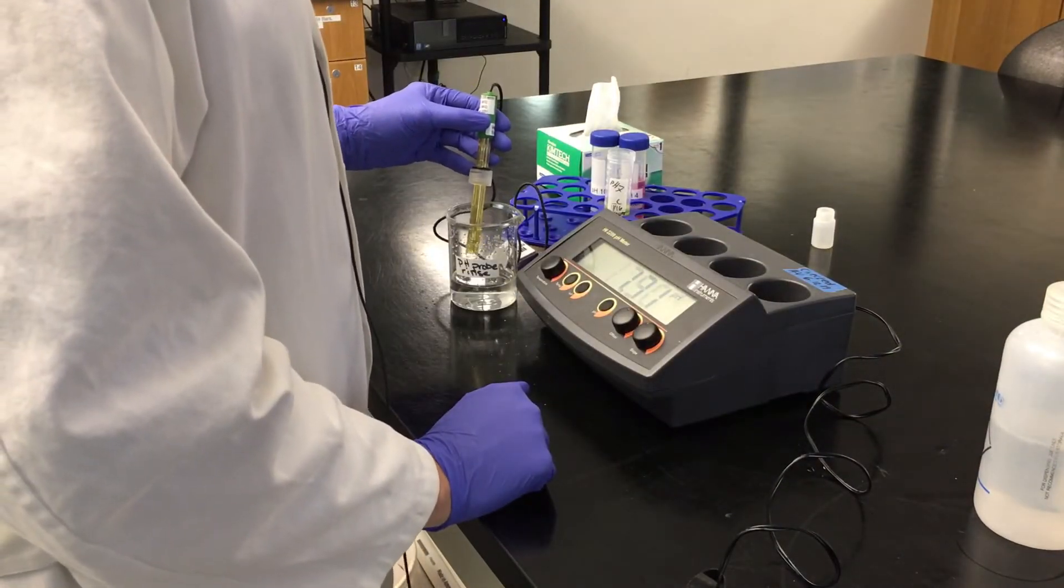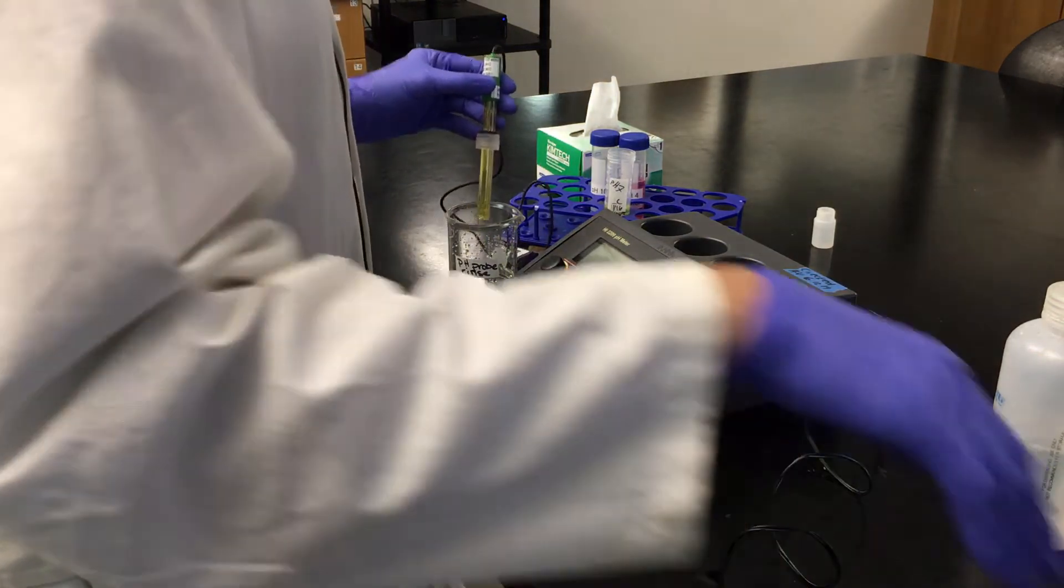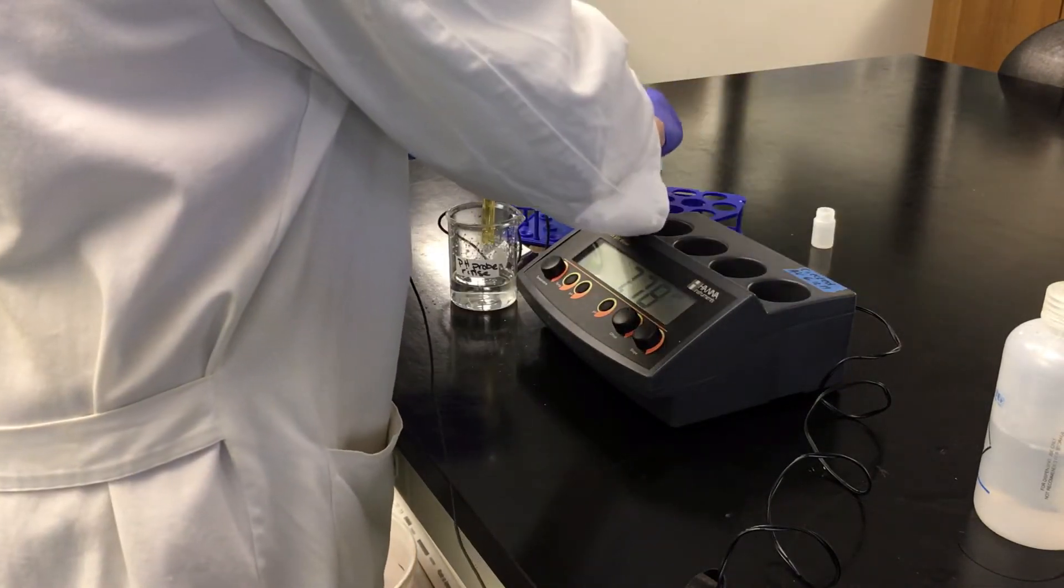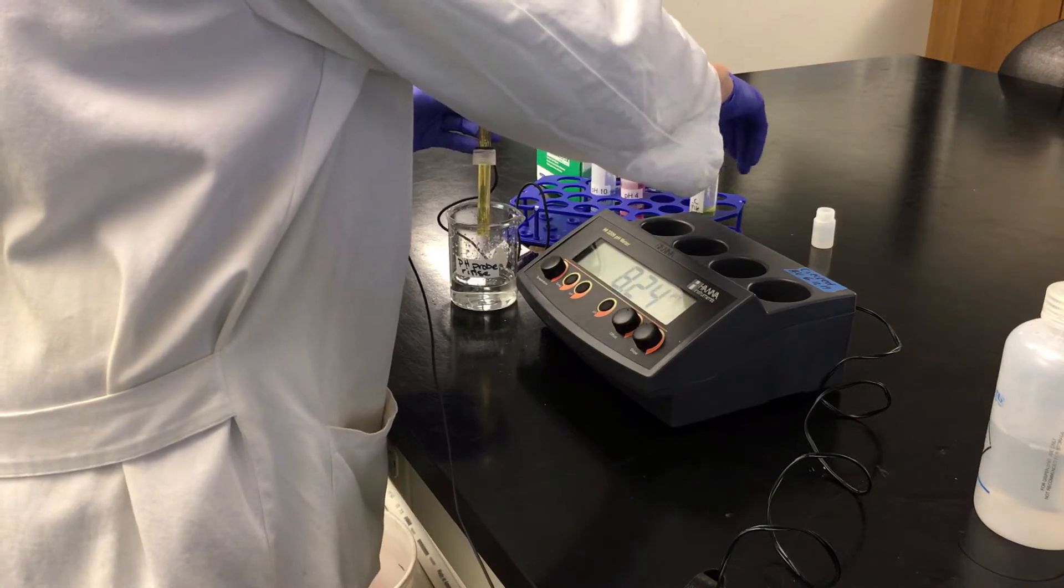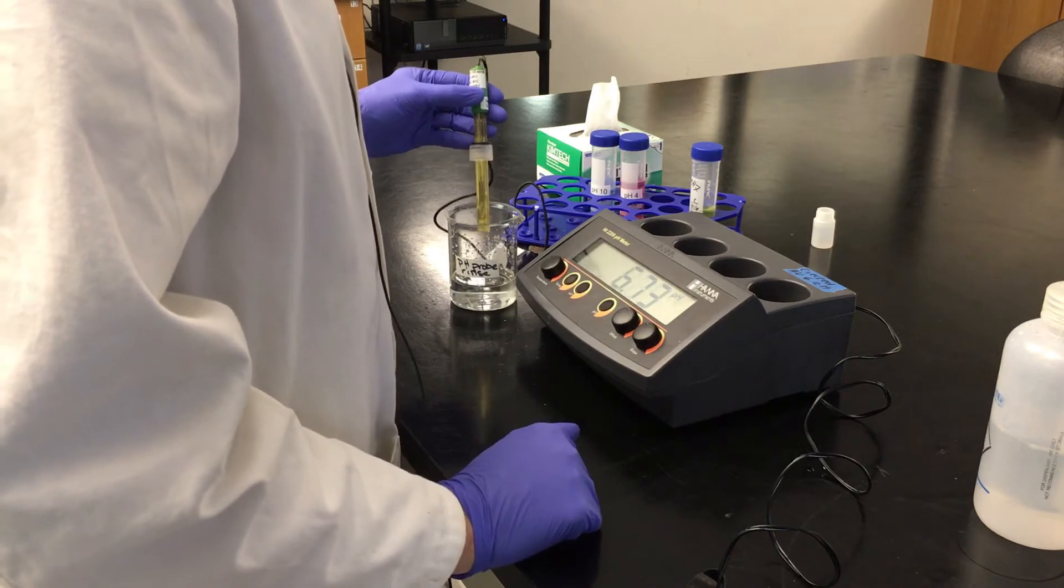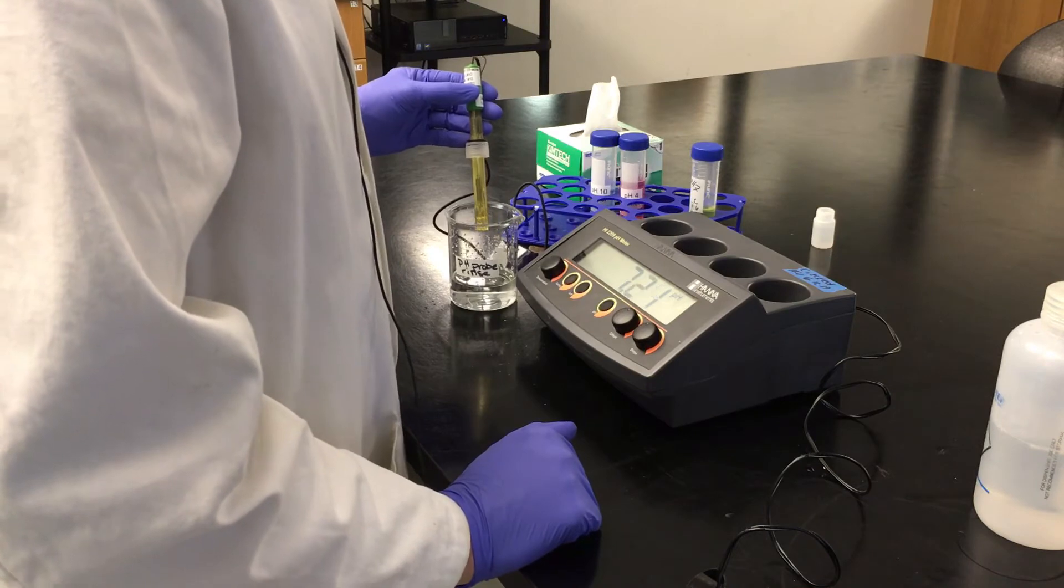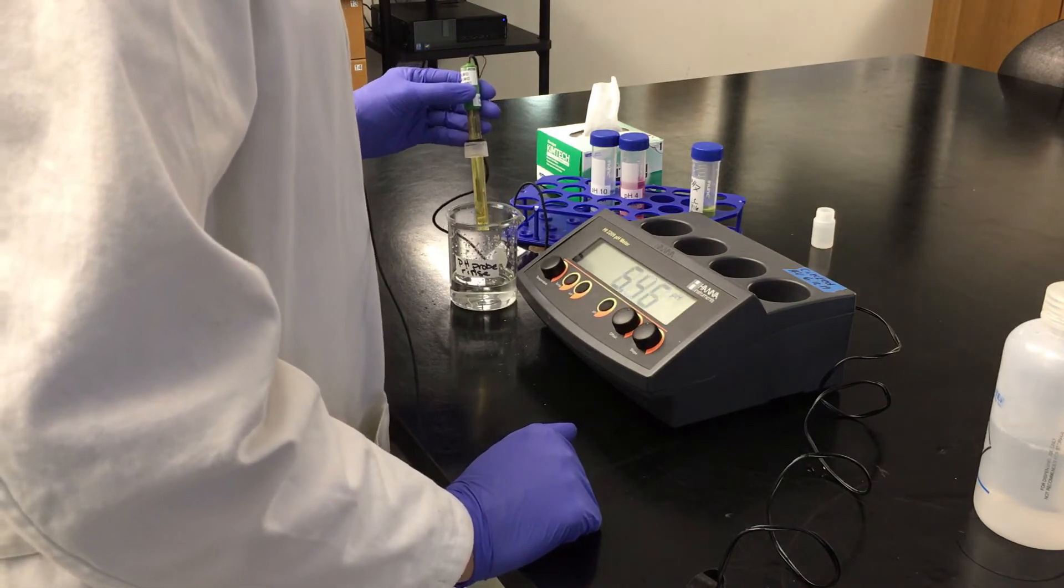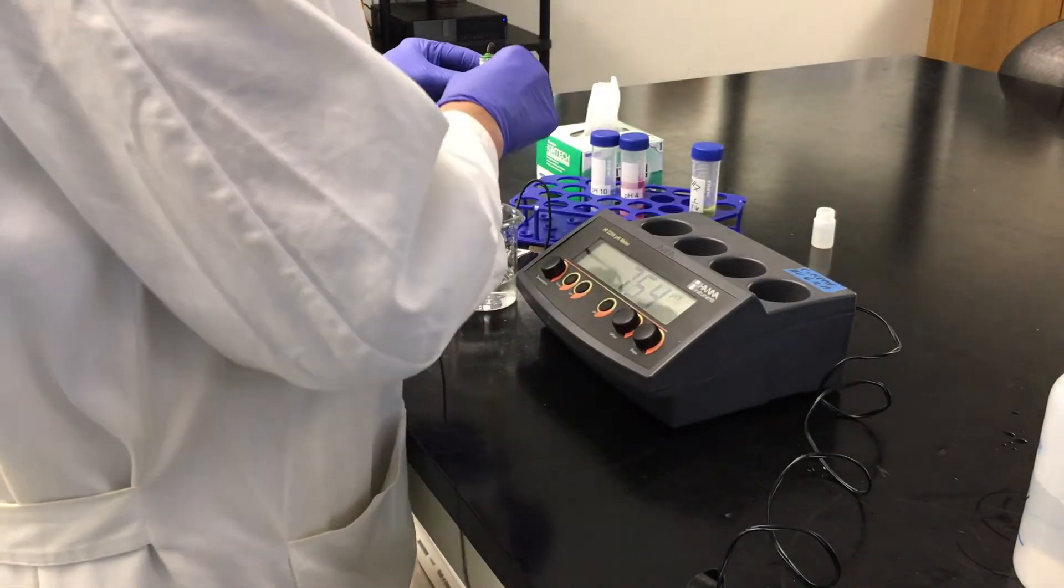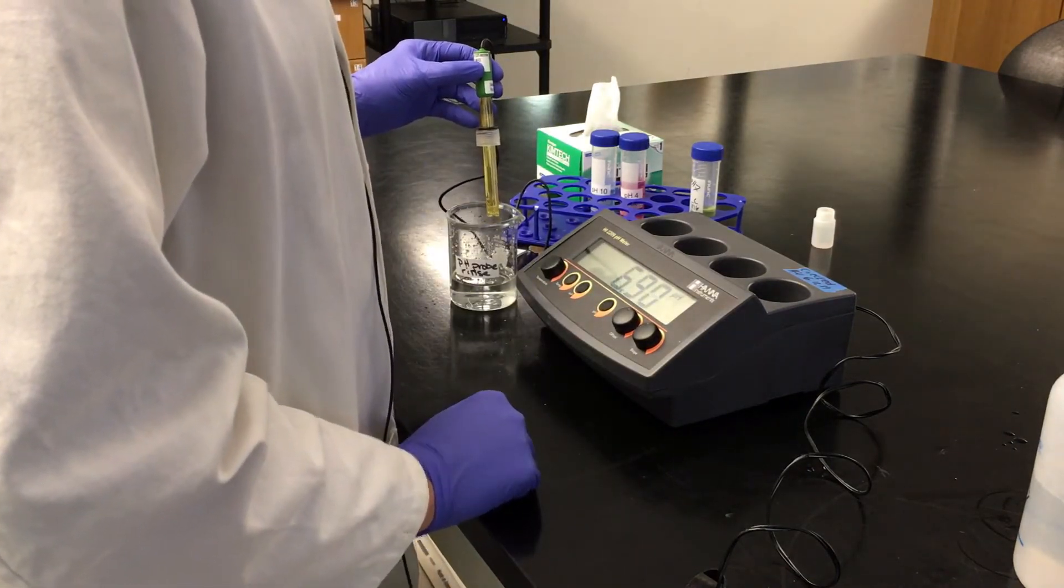Now we need to make a decision about which pH standard to use to calibrate with. We either have pH 4 or pH 10. And this will depend on the solution that I'm going to read. If I am expecting my solution to be between pH 4 and 7, then I will next calibrate with pH 4. If I'm expecting it to be more basic, then I would calibrate with pH 10. We're going to assume that the solution that we're going to measure is going to be a little more acidic, and it will be between pH 4 and 7.